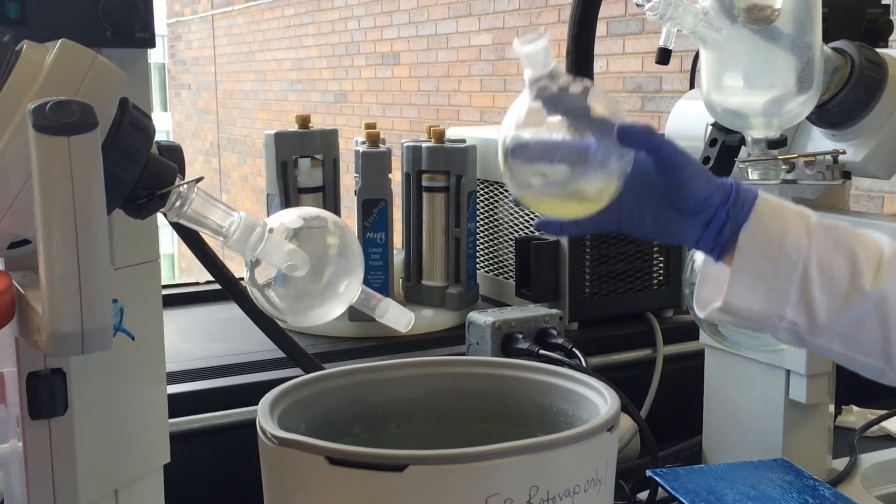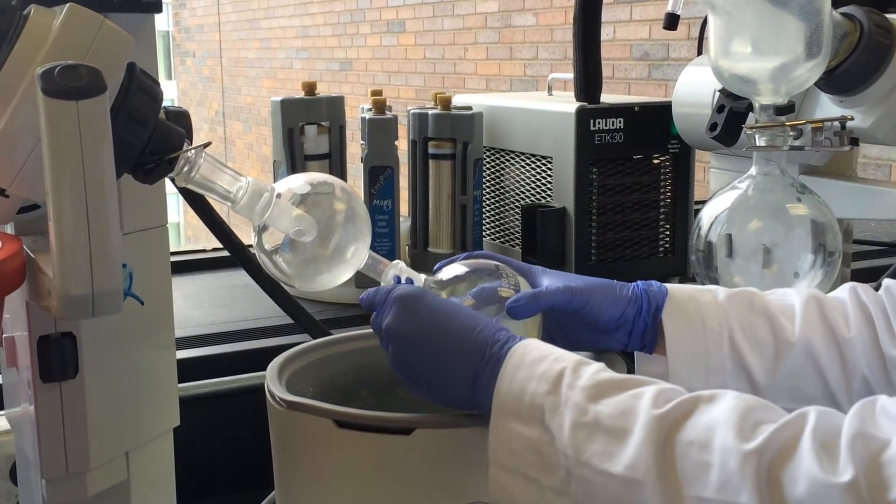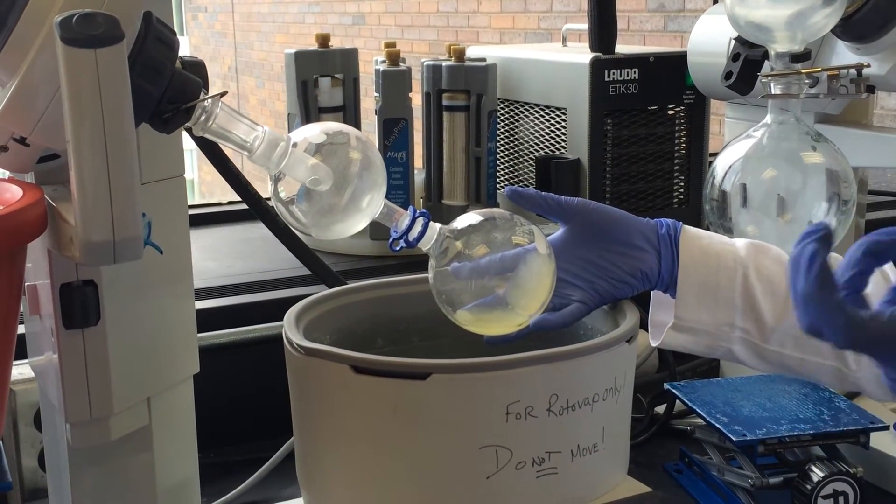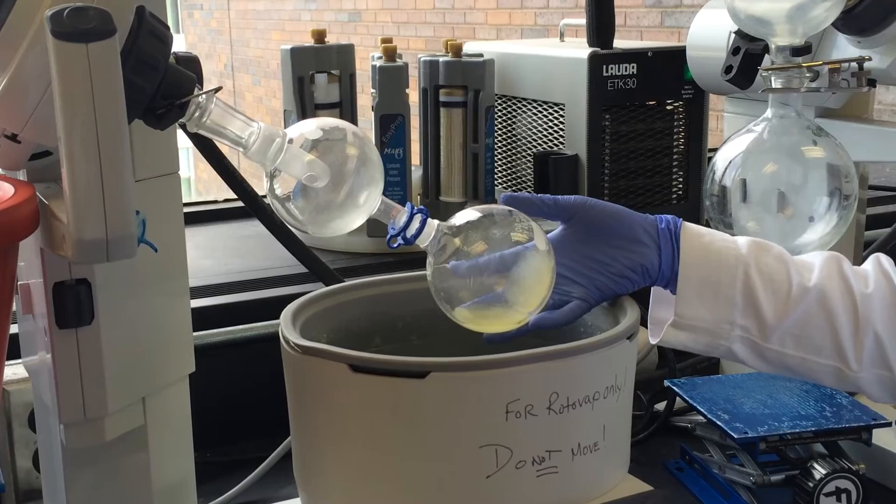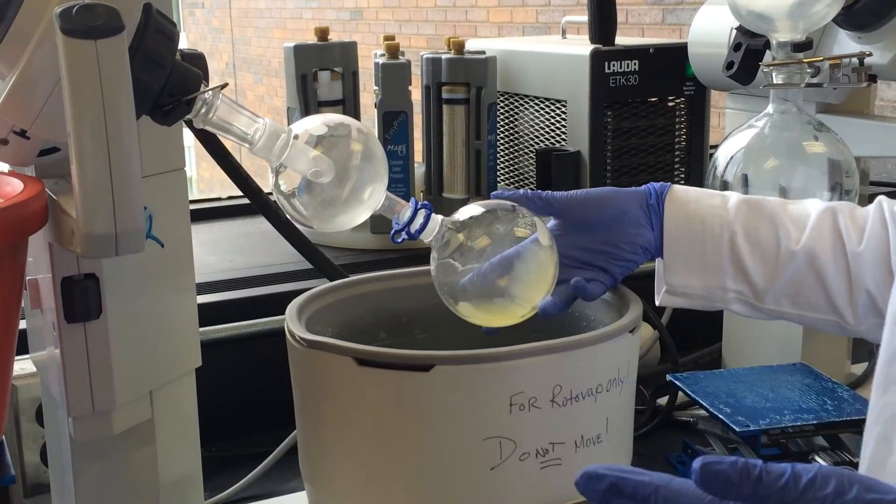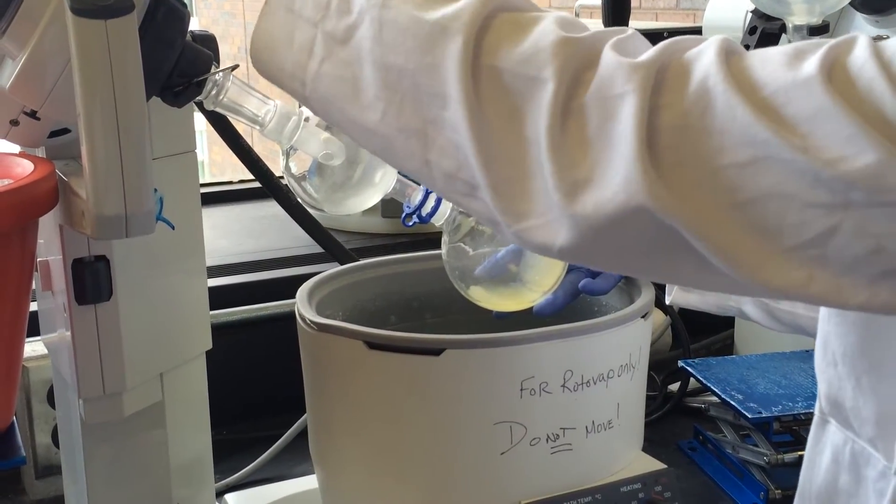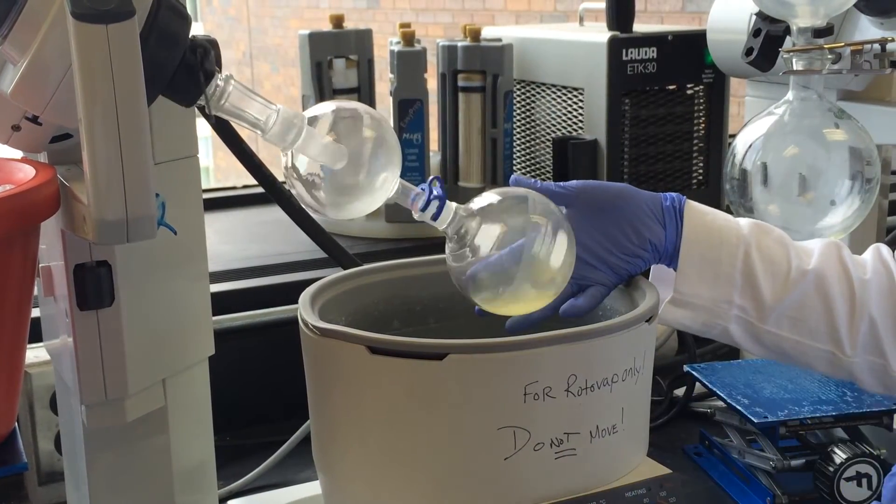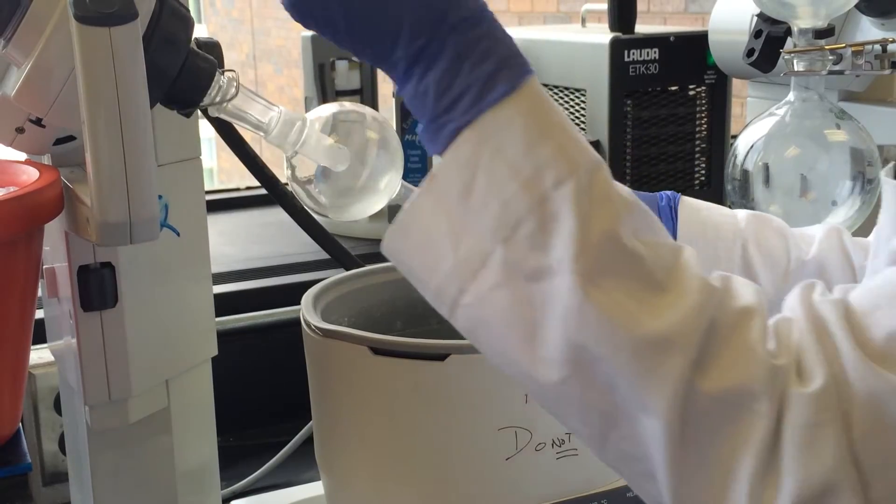Next, we're going to attach our sample to the rotovap to rotovap off the dichloromethane. This allows our sample to adhere to the silica gel. We have a video ready for you where you can learn how to use the rotovap properly.